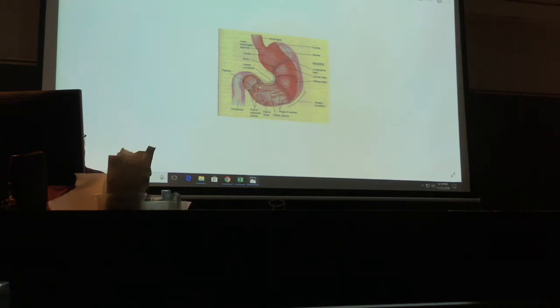And there's another sphincter at the end of the stomach called the pyloric sphincter. Gross anatomy-wise, another difference in the stomach is that instead of having two layers of muscularis externa, we have three. We have this outer longitudinal, now the circular layer is middle, and then there's an inner oblique layer. Remember oblique, the fibers run at an angle. We have a couple of curvatures of the stomach. There's a lesser curvature here and a greater curvature here.